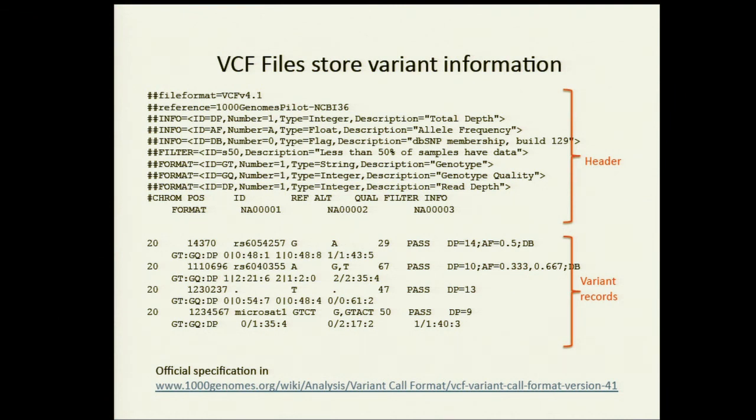So NA001 here has a reference genotype, 00. Here she has the GT genotype. Here it's reference, TT. And I should point out on this one, there's no alternate allele. This is a reference site where there is no alternate allele, and you can represent that in VCF too. Right. OK, thanks. These are indels, you should also say. So the GT, CT is reference, and one alternate allele is a G. So you've done a deletion of 3 bases. GT, CT to G. So you've lost these 3 bases.